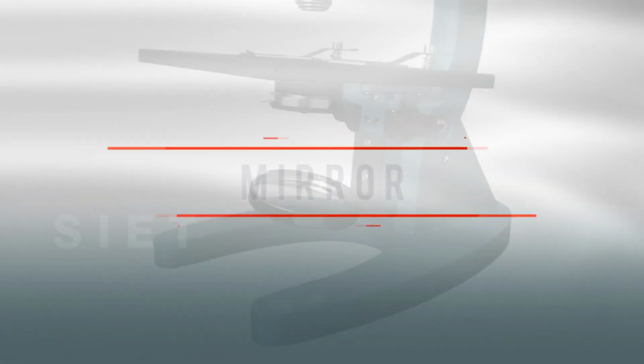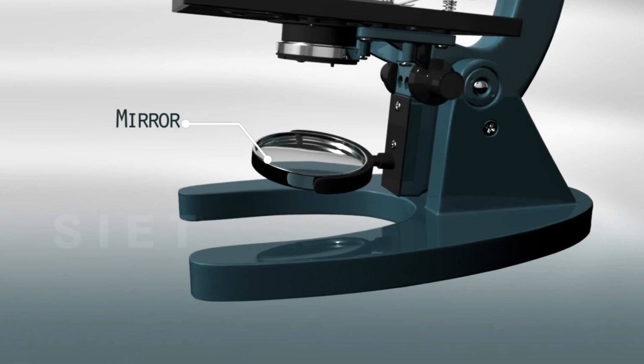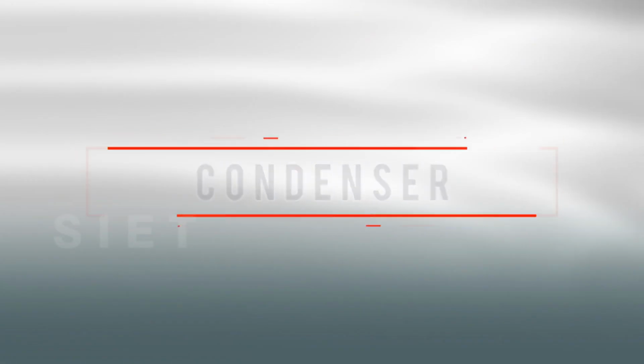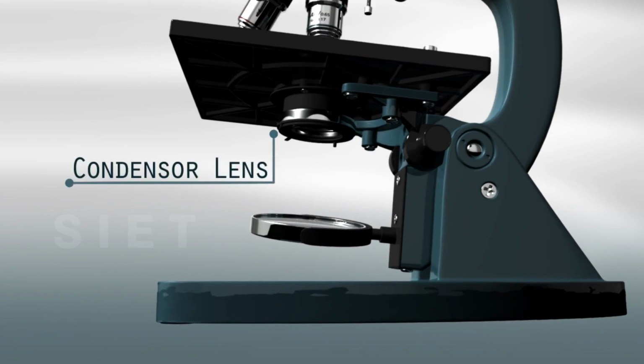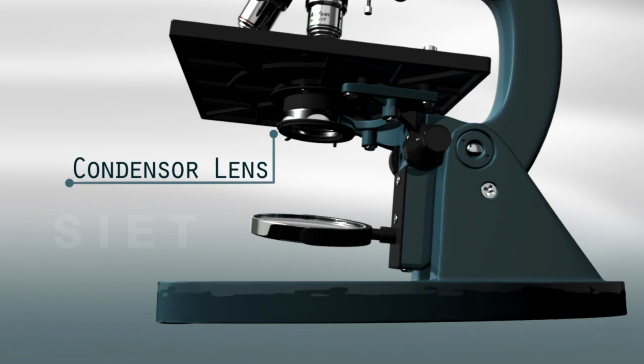Mirror. It is located beneath the stage and increases the amount of light shining through the condenser to your sample or slide. Condenser. The microscope has a condenser having a standard diameter of 39.5 mm, which collects and concentrates the light which passes through the sample.